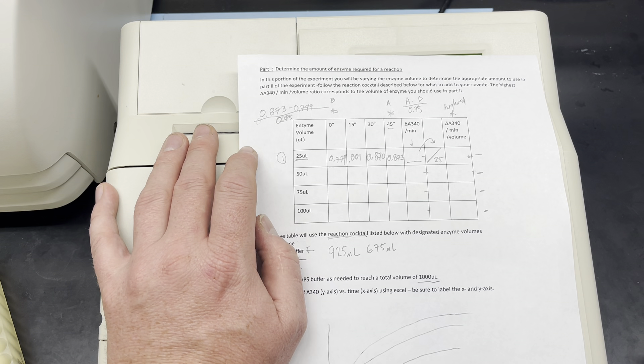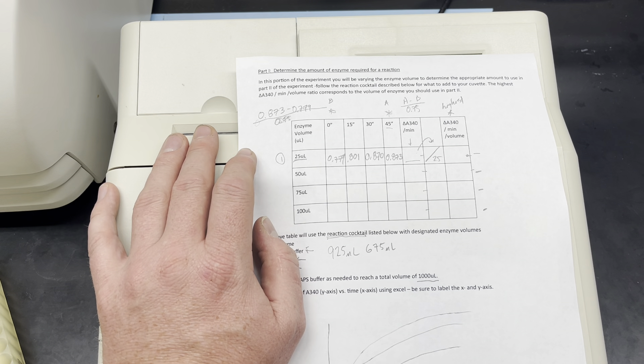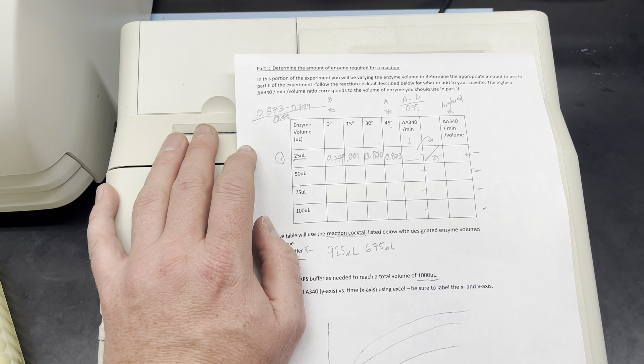That gives me a total volume of 975 microliters. Now I need to set up my spectrophotometer to take the appropriate readings. I'll press lambda to bring up the lambda assay. It asks how many wavelengths I want to read — not what the wavelength is, but how many. It defaults to one, which is correct, so I press enter. Next it asks for the wavelength, which is 340 nanometers. I enter 340 and press enter. This is before I've added my enzyme. It asks if I want to subtract any background — I press enter to say no, and now I read my blank.